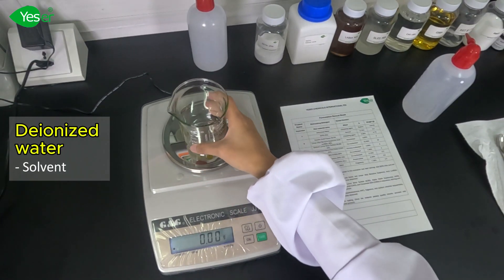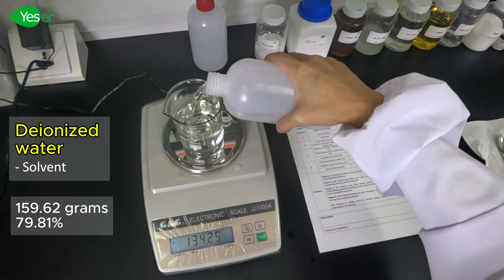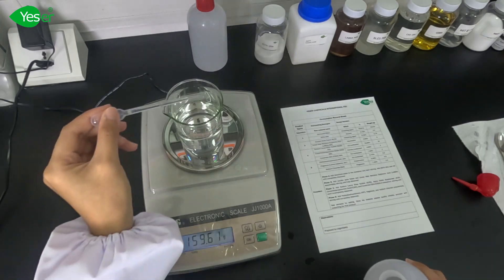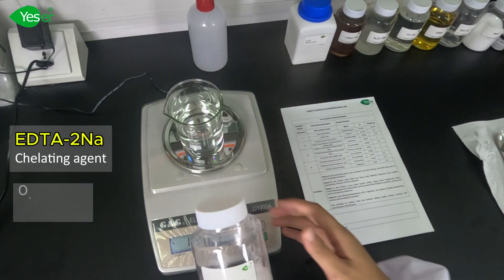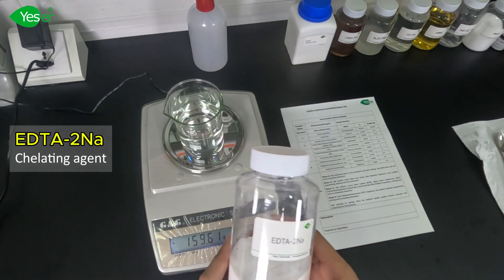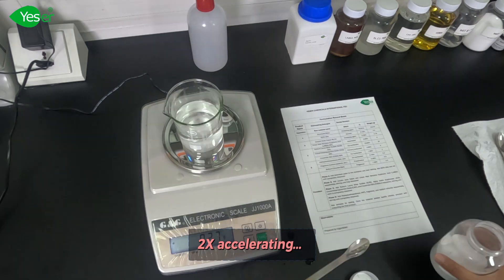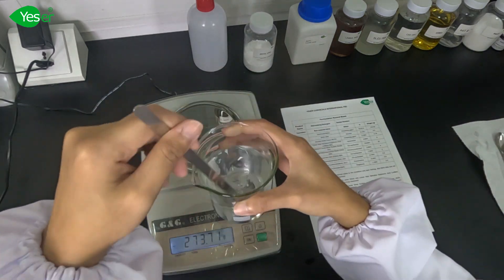First, we will weigh about 0.2 grams of EDTA disodium, or 0.1% of the formulation. This chemical is highly effective in binding to metal ions to maintain the activeness of the surfactants used in home care formulations. This also enhances the cleaning efficiency of our product.